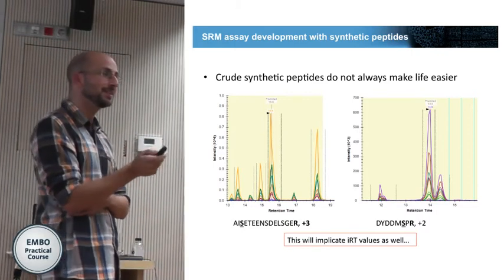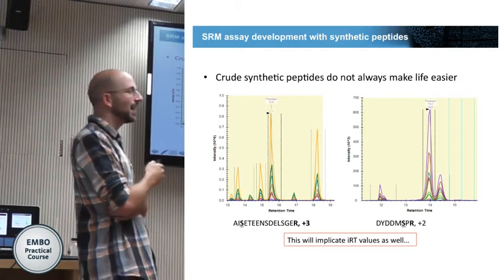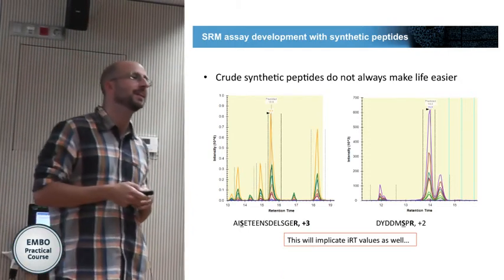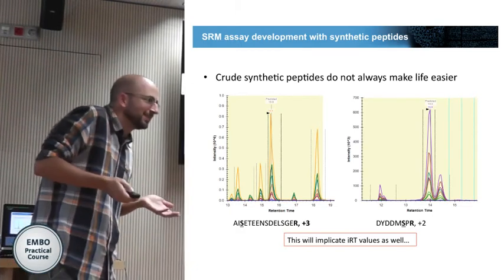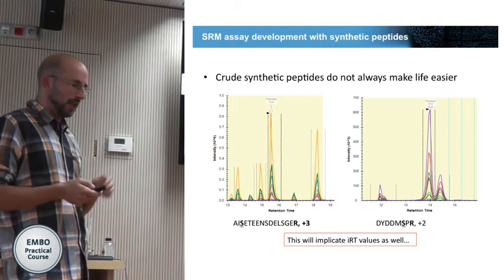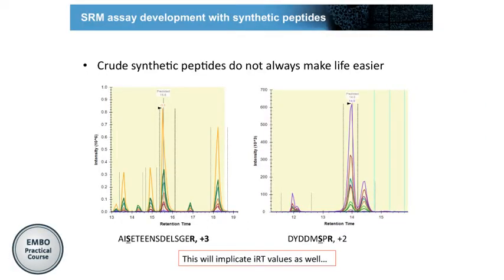Rearrangement of the phospho is an interesting theory. There have been many claimed possibilities that phosphates jump from one to the other. I don't know. Could be one explanation. But I'd like to remind you that this is SRM and we have used a window of 0.7. So what happens with a window of 0.7? Isotopes. But this you would cover for the main one.